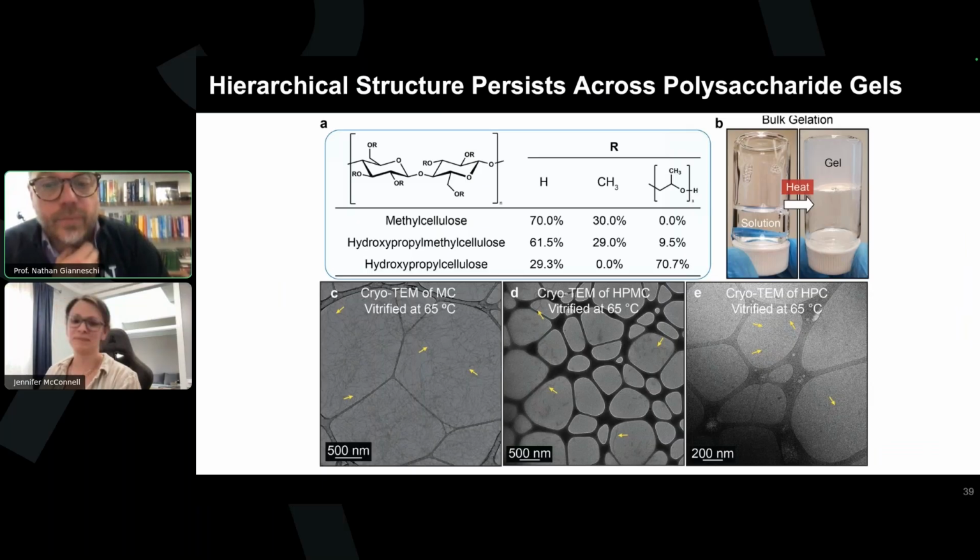And I think we're dealing with problems of confinement. I would argue that we're getting better resolution, but you're still dealing with resolution problems that are inherent to the thickness of the liquid cell in the sample. So the easy answer for me, without having a conversation about it, would be, yeah, all data helps, right? And it, of course, could be used correlatively, but may actually be superior because of exactly the reason that you're asking. There's just less sample prep and confinement problems.